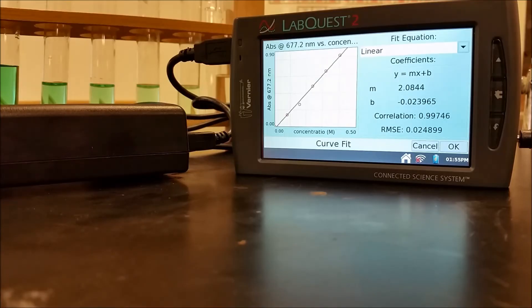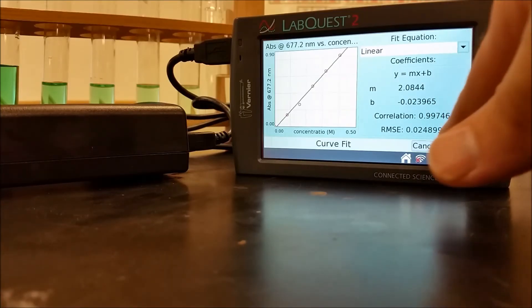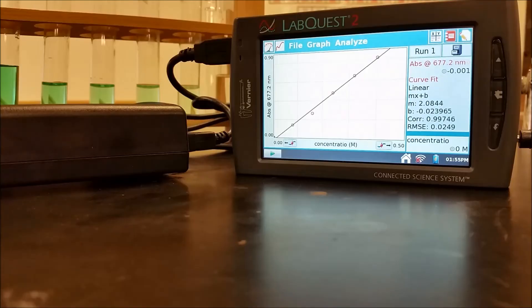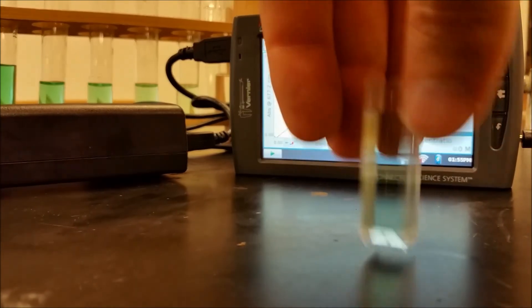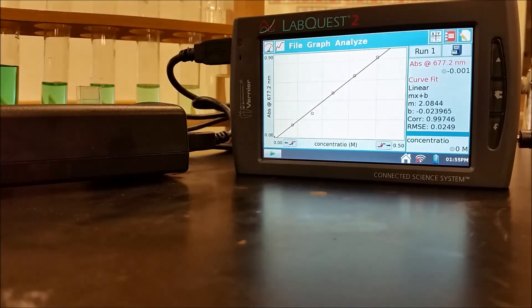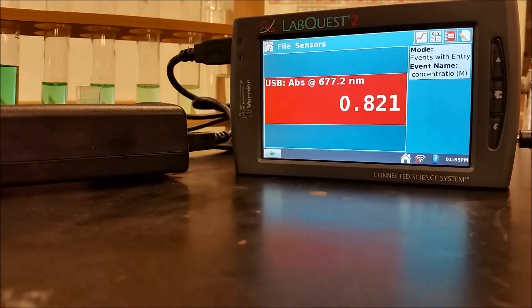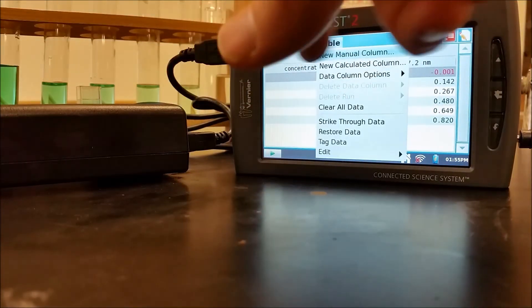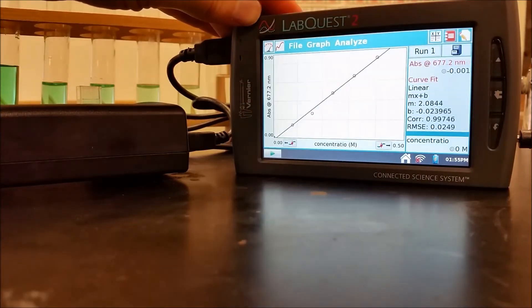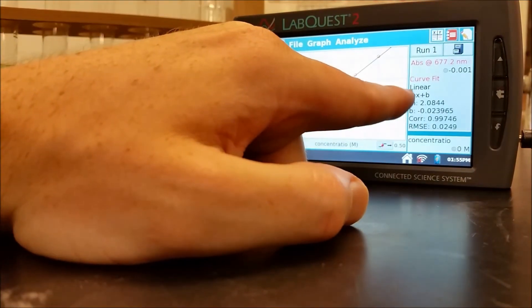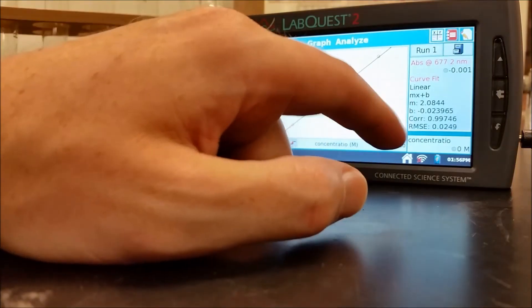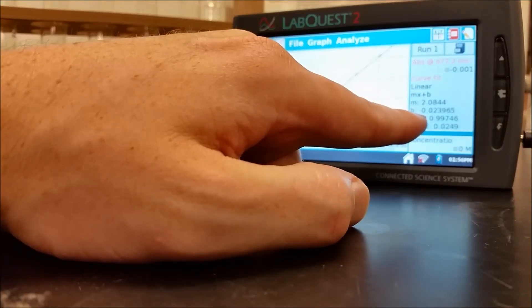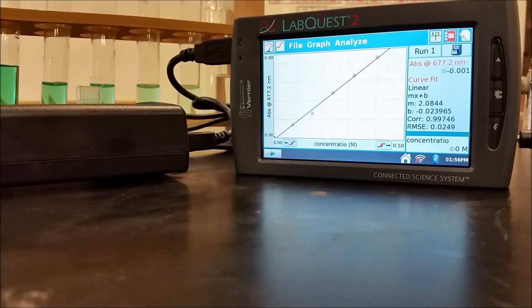I'm going to take my unknown and put that in. So here's my unknown solution. And my meter says that it's 0.260 is the absorbance. So what I can do is I can plug in 0.260 as y and then I can add 0.023965, divide by my slope and that'll tell me what my concentration is.